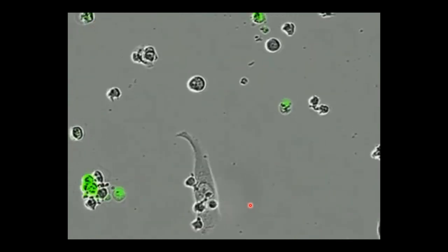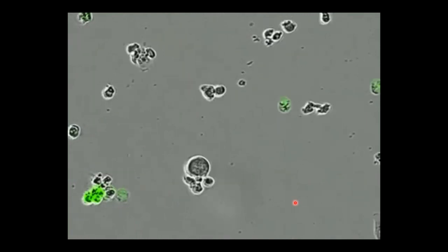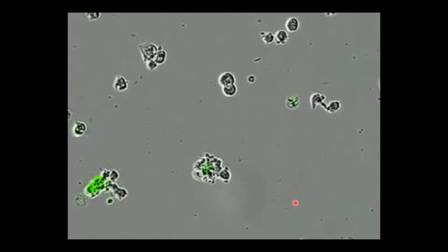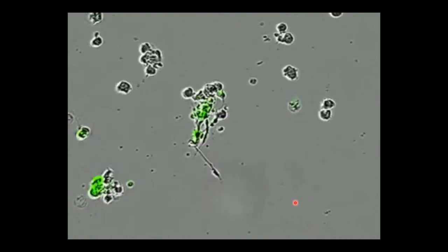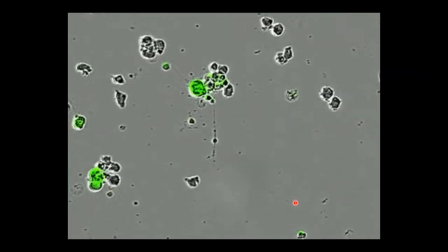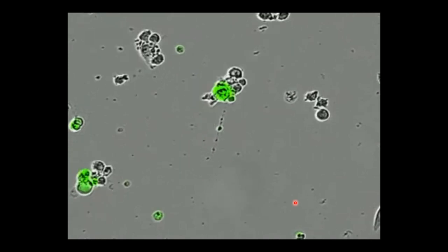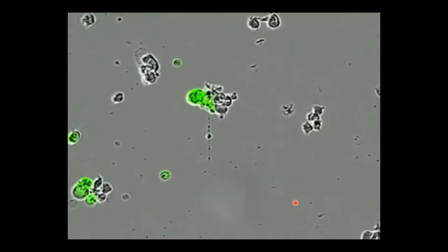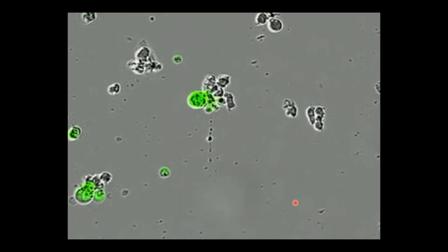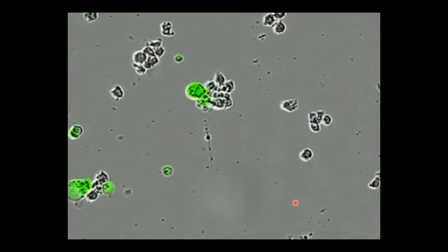And we can see eventually that cell start to round up, and then later on, we can see that green fluorescent signal come up as that pancreatic cancer cell is being killed by the NK cells. So whilst, of course, we can get quantification of this process, we can also get very good qualitative information showing that we have engagement of our tumor cells with our immune cells.